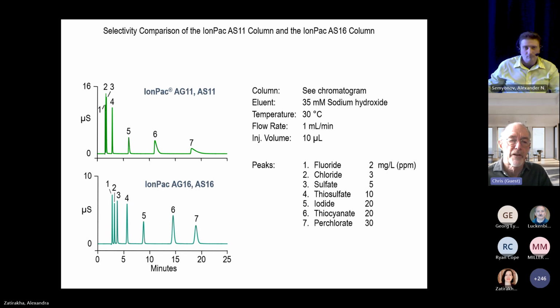If you've ever used phenolic eluents, well, they're usually not the highest purity chemical out there, although phenol is, but phenol you can't use as an eluent because it oxidizes under alkaline conditions. You need a para-substituted phenol. And the problem is most para-substituted phenols, which block the quinone formation process, are not very pure.